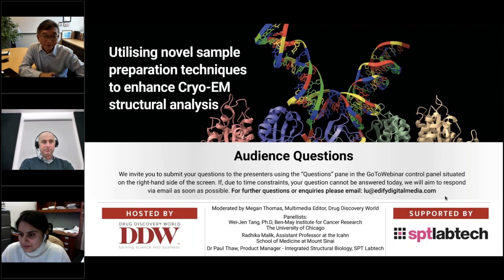Yeah. So what we typically do, as a lab from a crystallography background, is generate enough protein. So quantity of protein, don't believe you don't need a lot of protein. You do need a lot of protein to optimize your sample. So that's very important. So don't be fooled by saying, oh, you need a minimal sample. So what we typically do with a solo protein is go through differential scanning fluorimetry to find out what's the temperature.